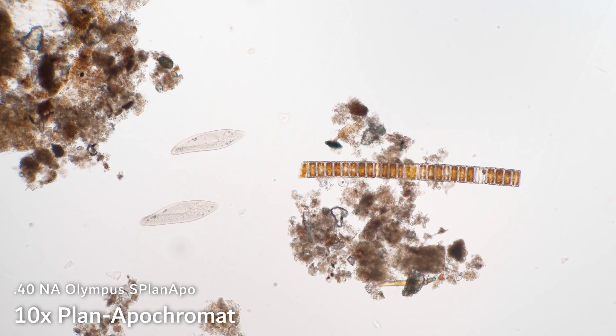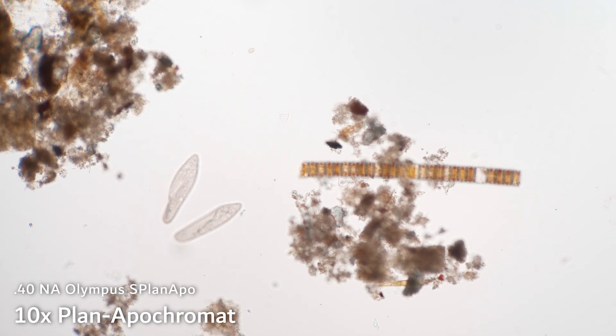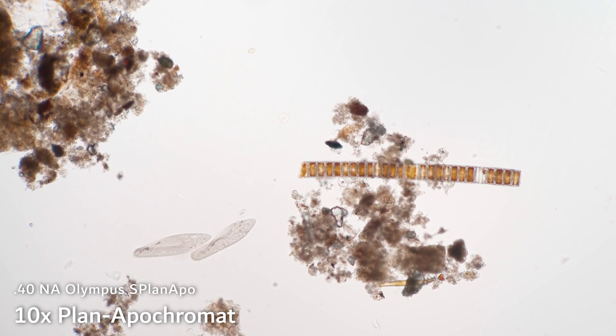Just like the previous lens, this is also plan. So if I'm focused in the center, then the top left is also nicely in focus. But it also brings green, red, and blue to the same focus. That sort of translates into a few subtle changes — the chloroplasts inside of this algae, for instance, I feel like are a bit better represented here. Small details in color are better preserved. And then the other thing is that if I move out of focus, I don't see that same color fringing. I see a much more natural blurring — if you've done regular photography before, the word that everybody loves: bokeh. The bokeh on these S plan Apo objectives is a lot more pleasant.